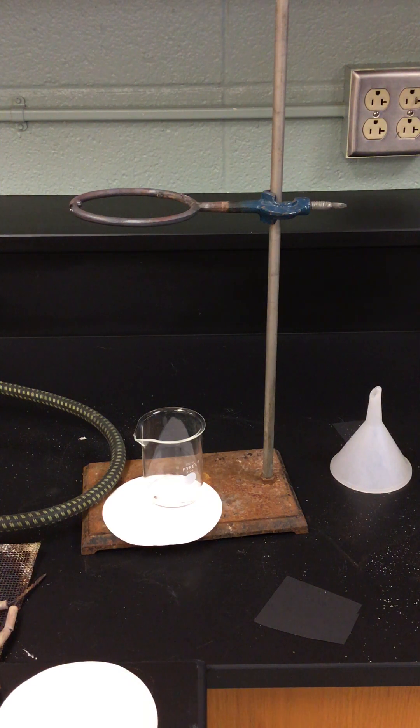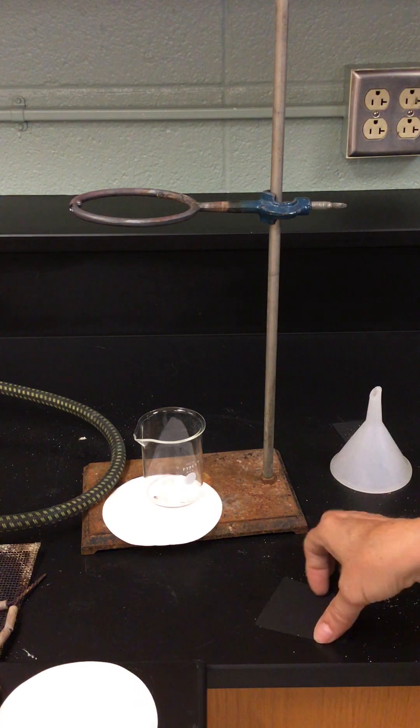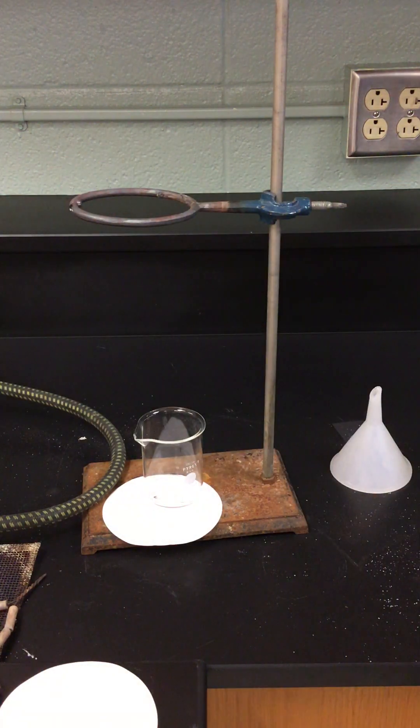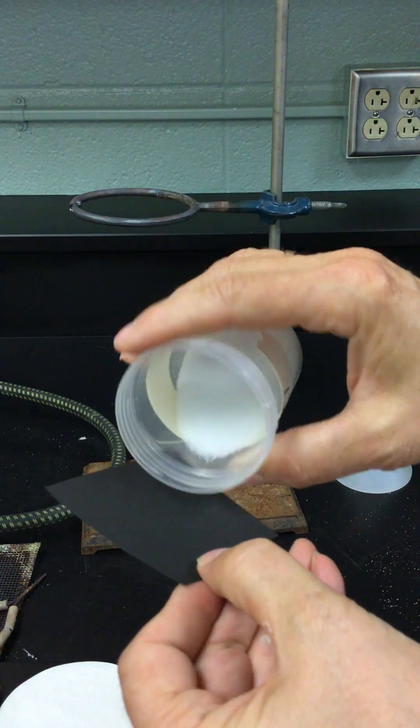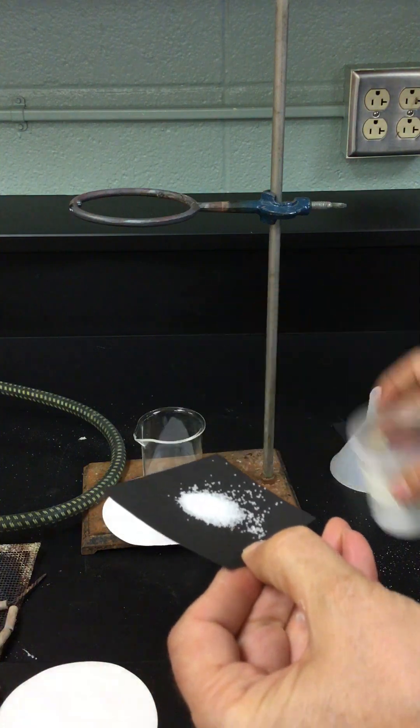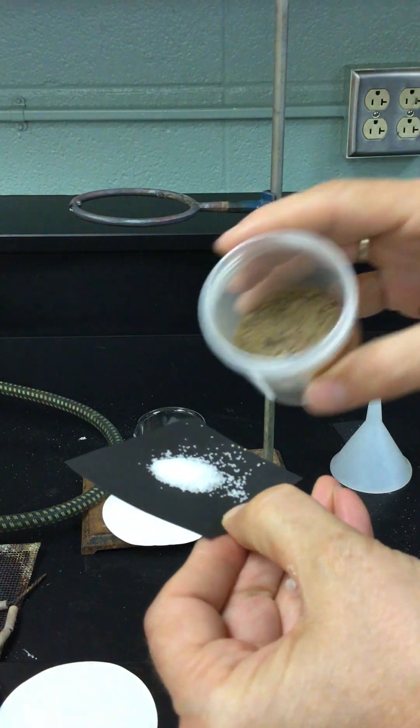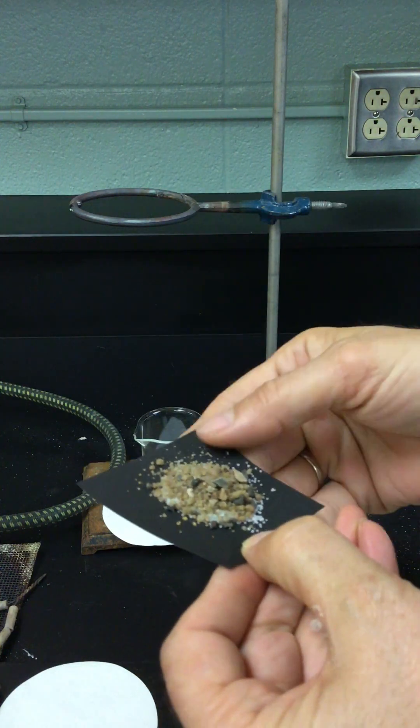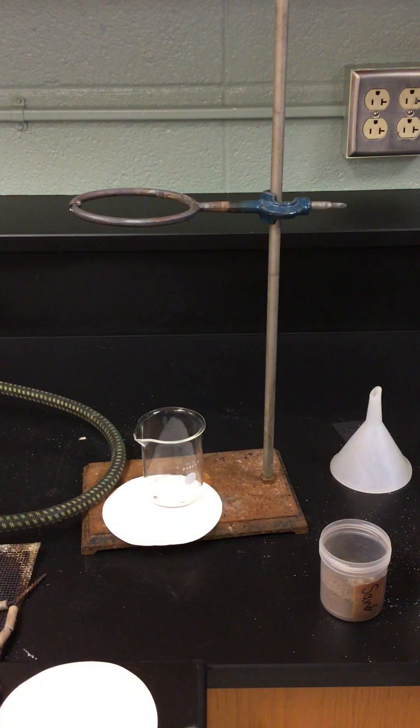This is part B of the lab and we're doing step number six. I'll be combining sodium chloride and sand on a piece of paper. I'm going to put them on this piece of black paper right here and I'm going to take a little salt and a little sand.